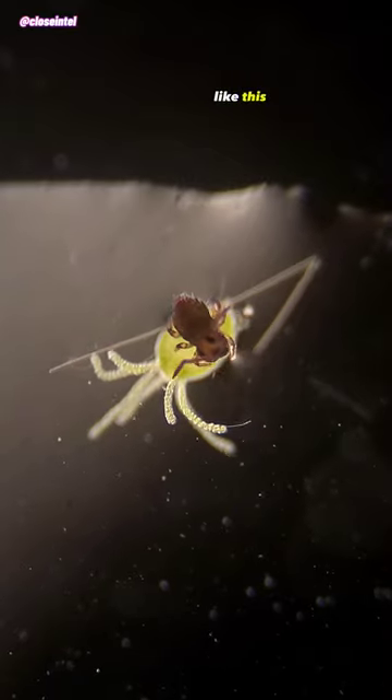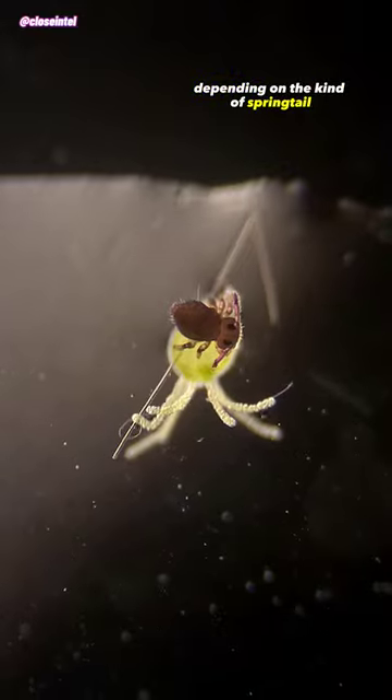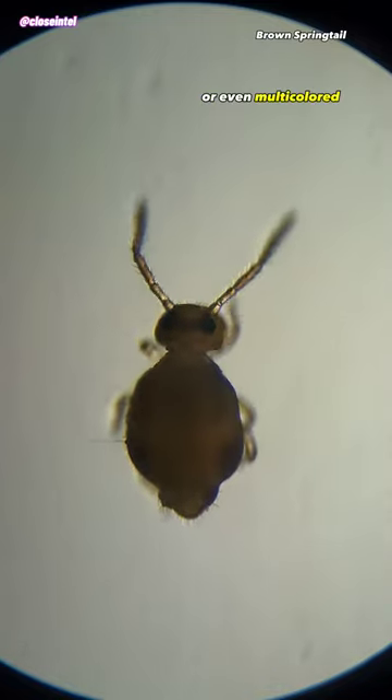They come in a globular shape like this one here, but it can also be a cylindrical shape as well depending on the kind of springtail. Springtails can also come in a variety of different colors like brown, yellow, white, pink, grey, or even multicolored.